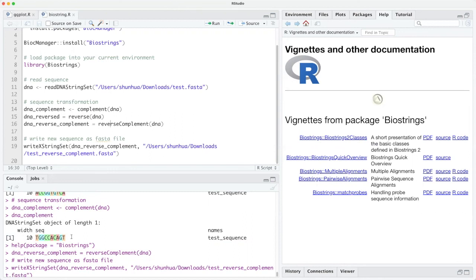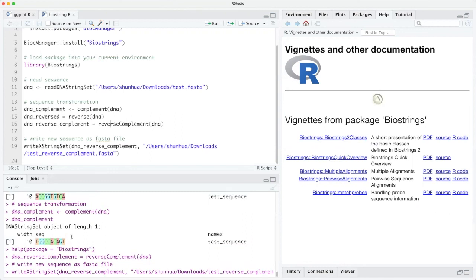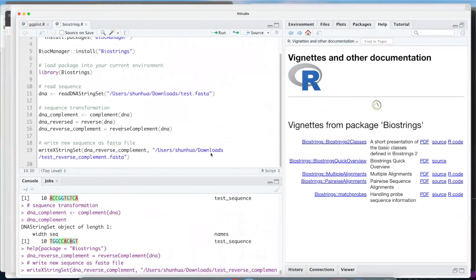If you have a lot of results that come to the screen and wrap around on multiple lines, you'll see another number that tells you it's like the 47th element of that list. It's not a part of your data. It's just a pointer to tell you what row number or line number you're on. It's the element index. So just be careful about that. That's something people new to R don't understand. But after a while, you tend to even ignore it, right? Yes. Naturally I just ignore it.